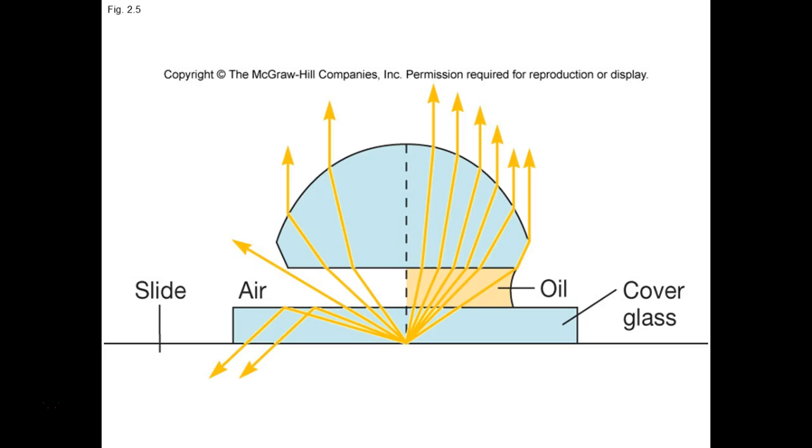I haven't used water immersion, but there are some, and I would love to get to do that because the oil is so messy. When you don't clean the oil off the scopes, it creeps in and causes the lens to be blurry permanently, which is the case for most of our high dries because students don't follow instructions.